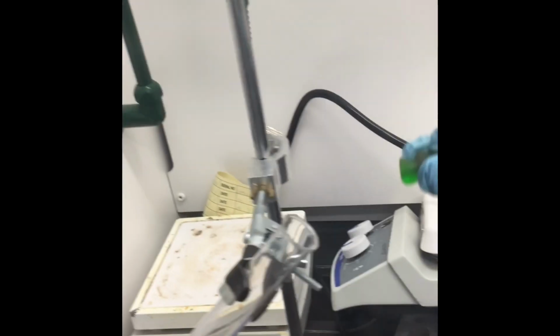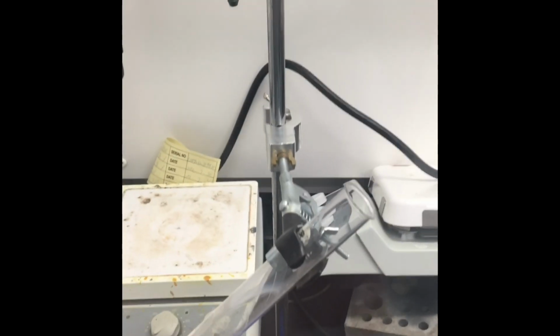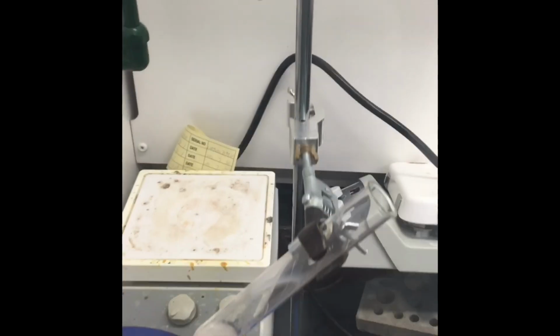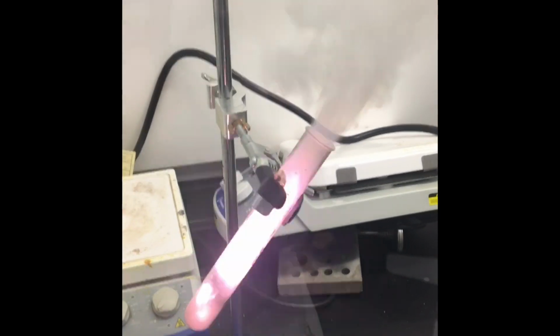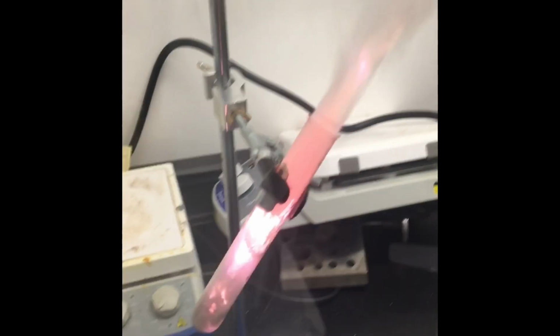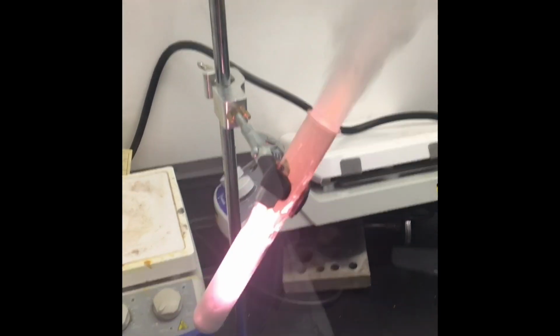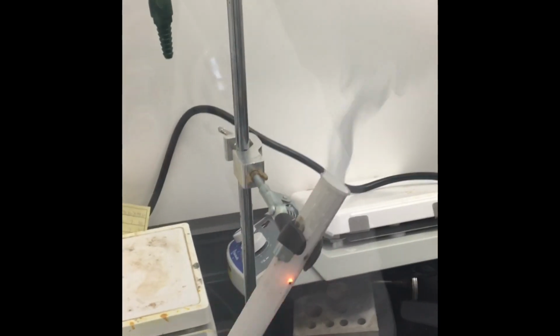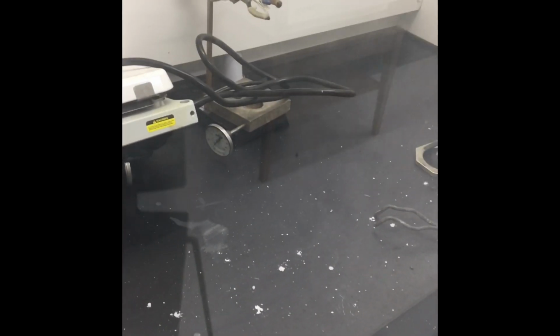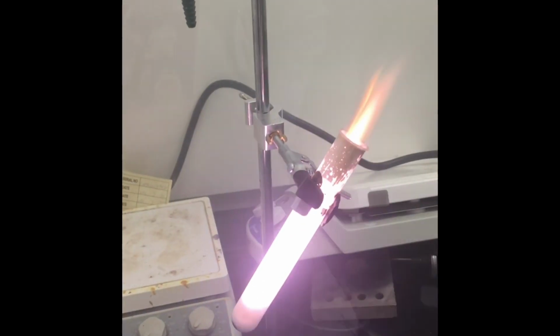Okay, so now I'm outside the hood, and let's see what happens when I drop it. I'm gonna use my hands because yesterday I tried with the tongs and the gummy bear kind of gets stuck in the tongs. So I'm just gonna do this. Whoa, look at that. Oh my goodness, let me turn on the hood because we're producing a lot of gas. Whoa, look at what happens over there. Okay, that gummy bear is gone.